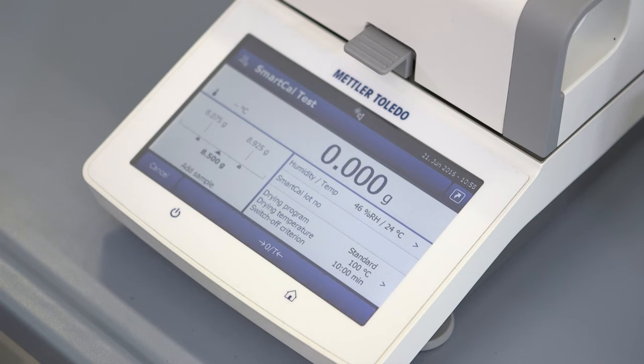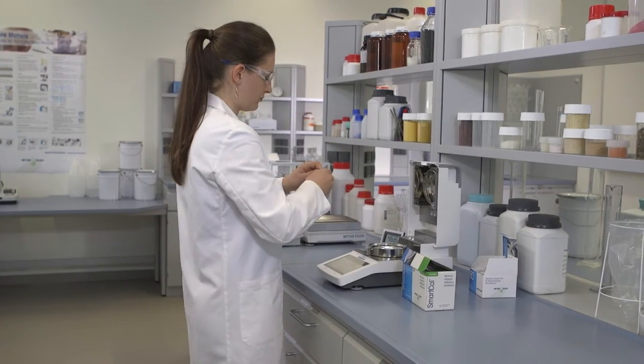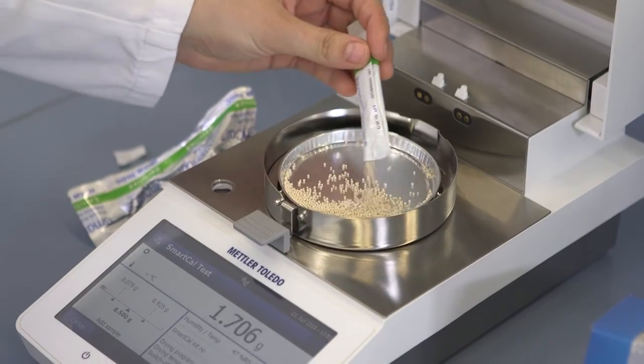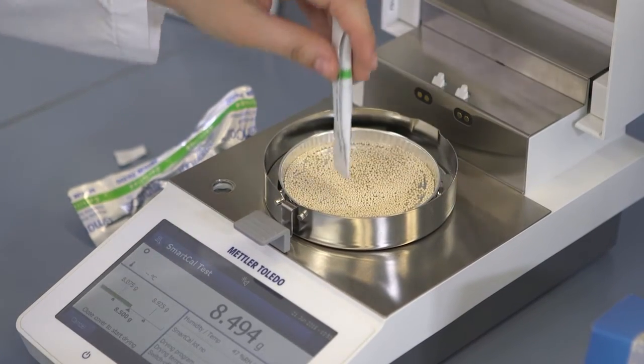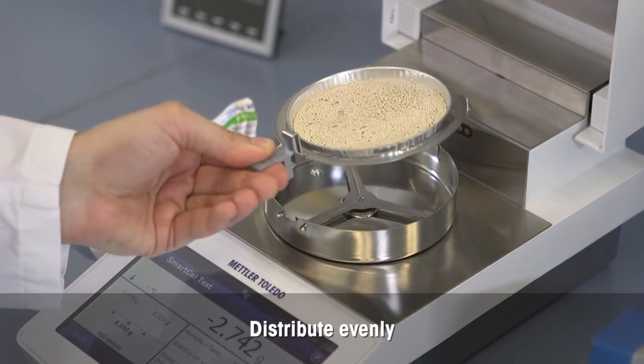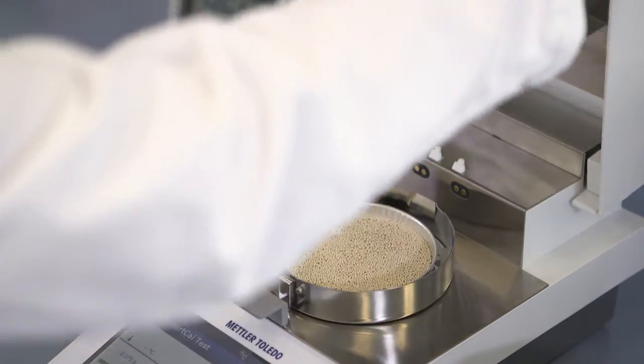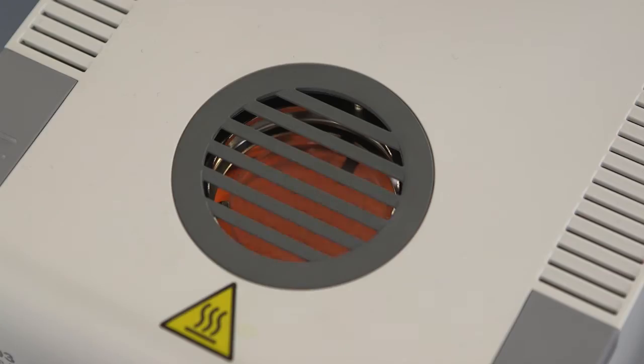Tear the sample pan. Open the SmartCal test sachet and distribute the entire contents evenly over the pan. Place the sample pan into the moisture analyzer. Close the lid, and the test starts automatically.